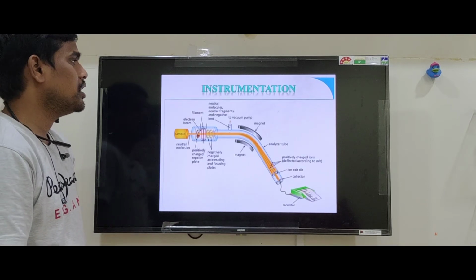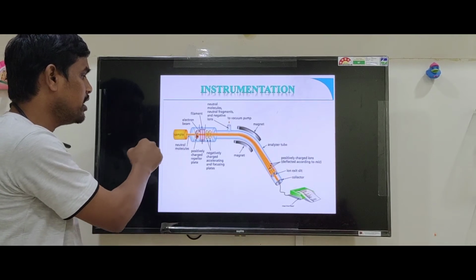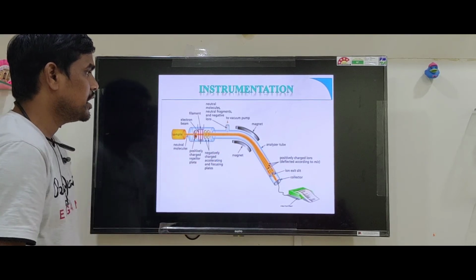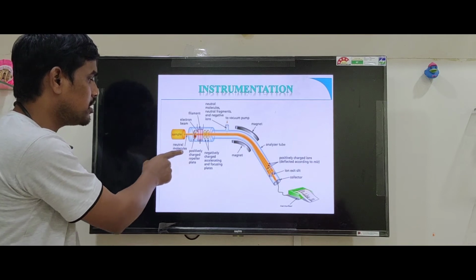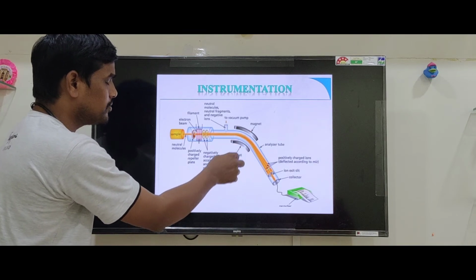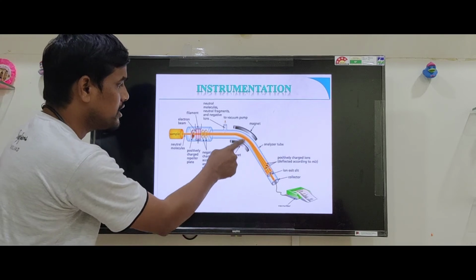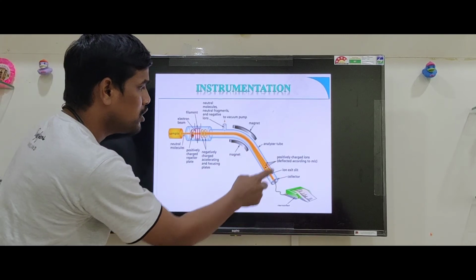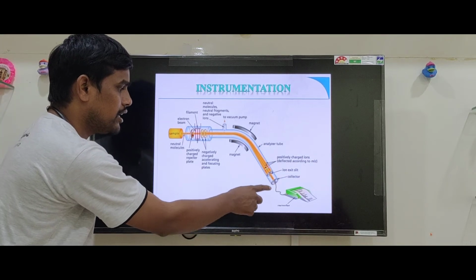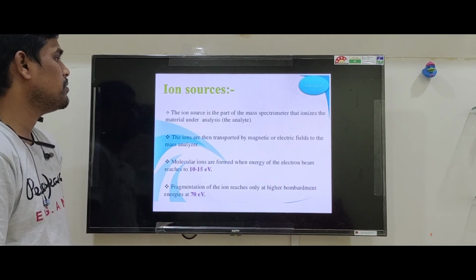This is the instrumentation of mass spectrometry. So we have a sample inlet, sample, electron beam and filament, neutral molecules, neutral fragments and negative ions going to the vacuum pump, and this is a positively charged repeller plate and negatively charged acceleration and focusing plates. These two are magnets with which we measure the speed of the positive ions, then the analyzer tube, and finally positively charged ions are deflected according to the mass by charge ratio, then the ion exit slit and collector, and finally the recorder.